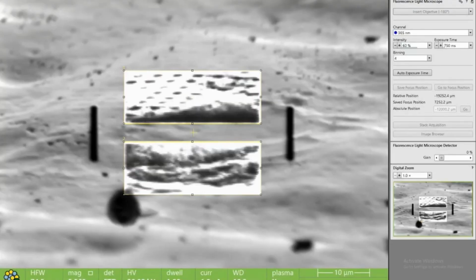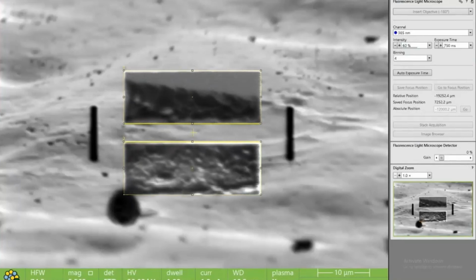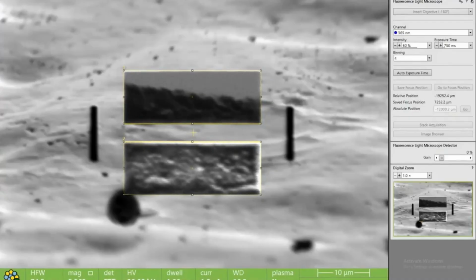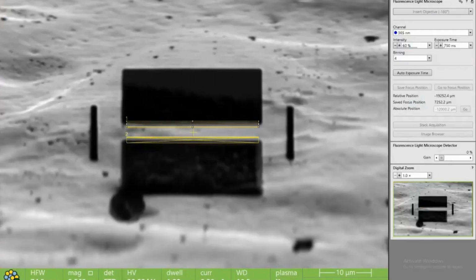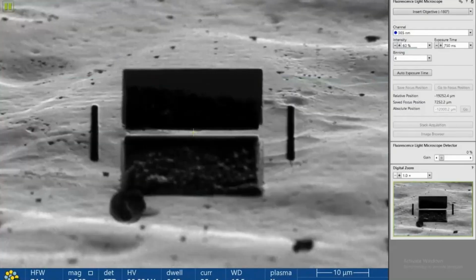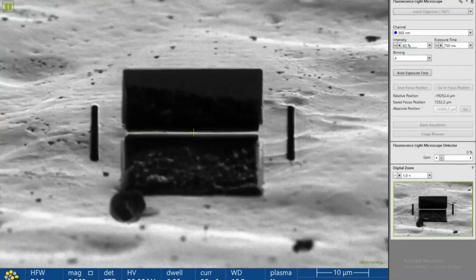So this is a look at the underlying system control software, XT, which is not displayed in the Web UI software. That's what's basically happening in the background. The system is doing a multi-step approach to produce the lamellas, starting with high milling currents in the first milling steps, and then going from the coarse lamella production in steps down to final polishing of the lamella. You can see here cleaning cross sections which are applied at lower milling currents until we have produced the final lamella from the sample.